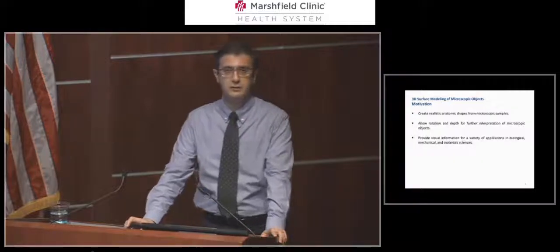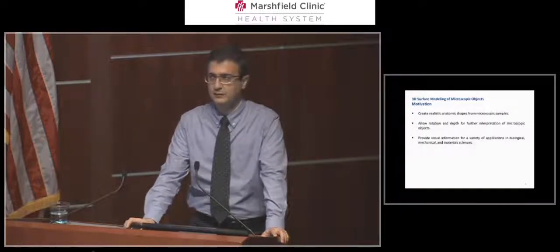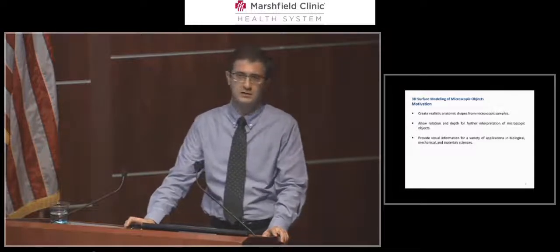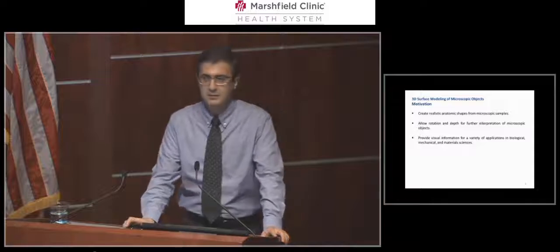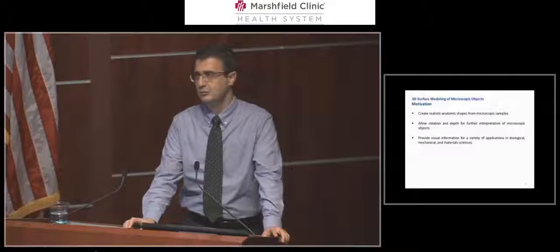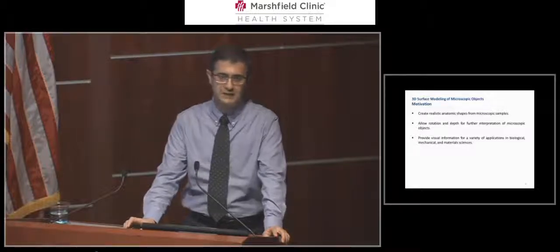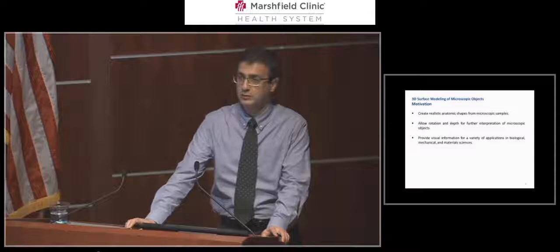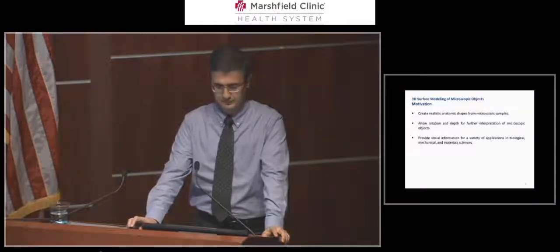The motivation of the work is to revisit the state of the art of 3D SEM surface reconstruction to provide better understanding of the work and bring advanced 3D technology into the scanning electron microscope community to create realistic anatomic shape from microscopic samples, to allow rotation and depth for further interpretation of microscopic objects, and to provide informative visualization for a variety of applications in biological, material, and mechanical sciences.